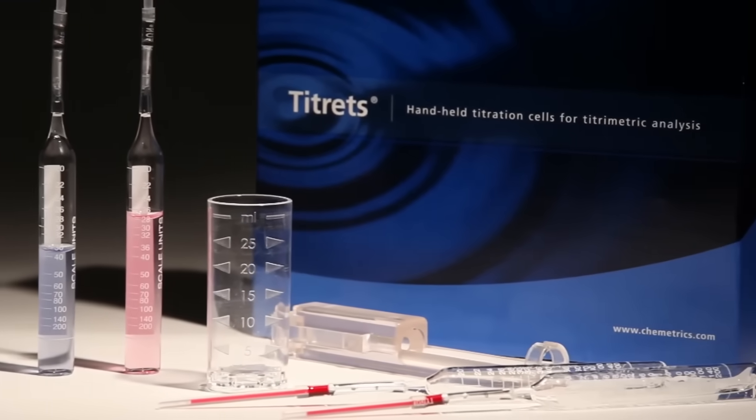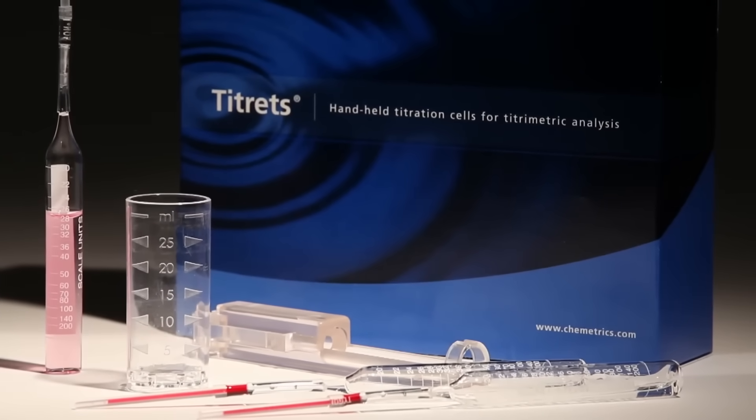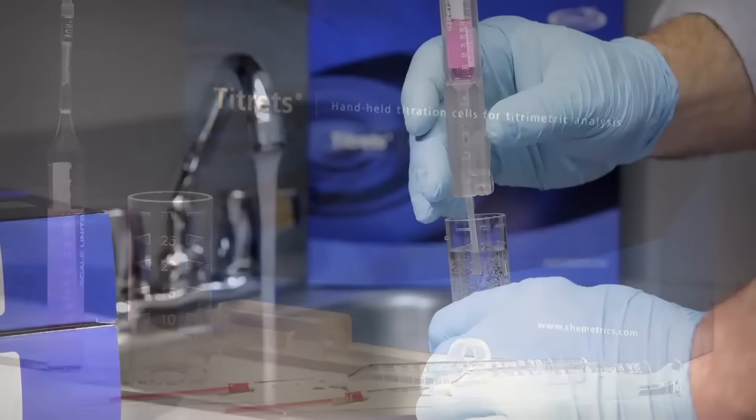Titrets kits include everything needed to perform 30 tests. Extremely easy to use, Titrets ampoules are ideal for lab and field use.